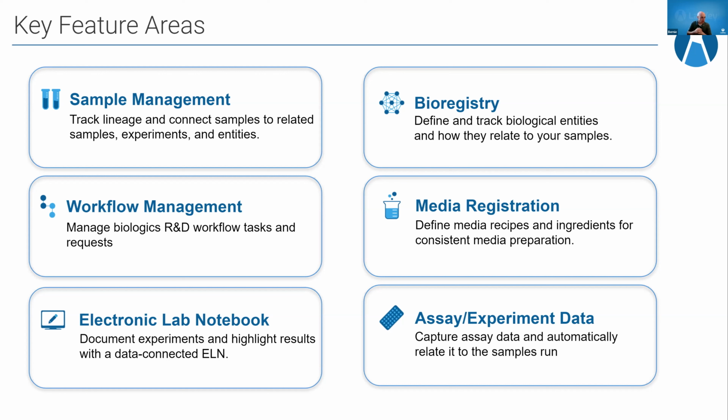And last but not least is our assay data framework, which allows you to capture experiment data, instrument data, and automatically connect it to the samples in the system. And with all the data in one system, looking across experiments for insights or to make decisions about your materials becomes a lot easier.